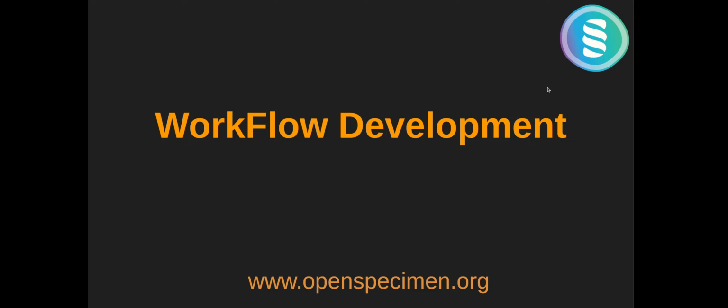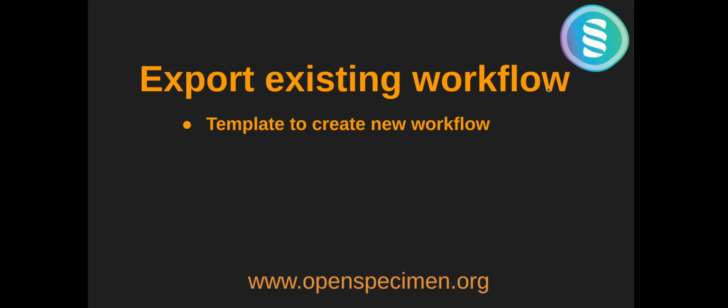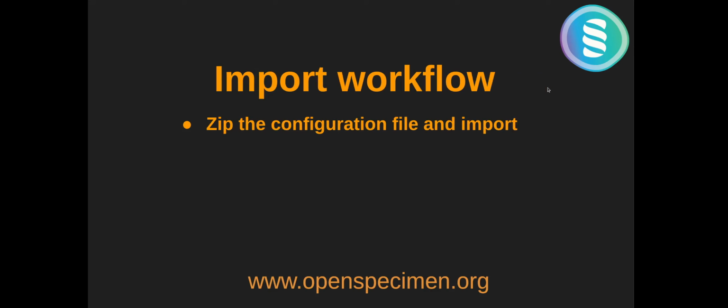So let's start. To create a workflow you have to follow these steps. You have to first export the existing workflow. This will act as a template for your new workflow, and you can use it to update the configuration files based on your requirement. And once everything is done, you can just zip everything together and import, and it will create your new workflow. Okay, now this is clear.